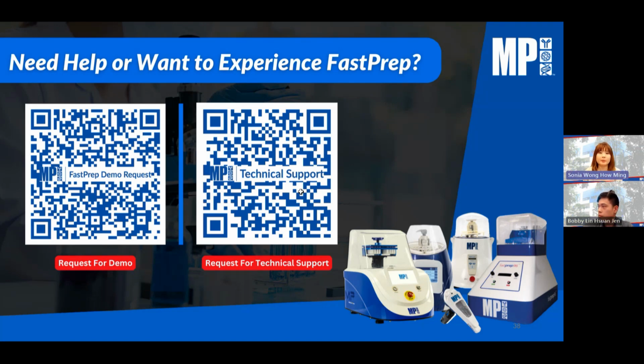That's a very interesting question, because you are looking at only enzymes instead of DNA or RNA extraction, meaning you can probably go with not so harsh homogenization. In this case, large size beads would probably be sufficient to create a compaction that breaks open the sample that you have, which is fungi, just sufficient for you to get your enzyme.